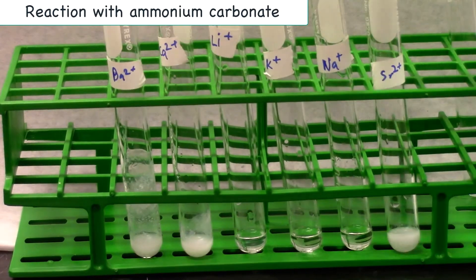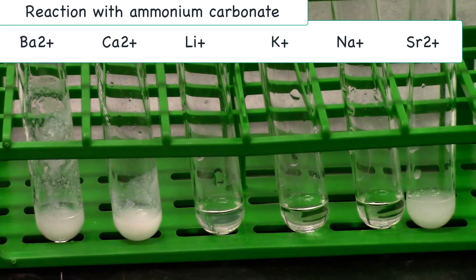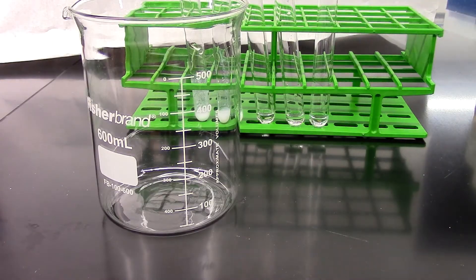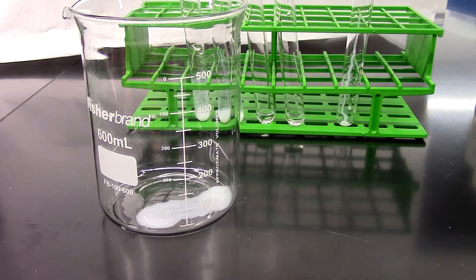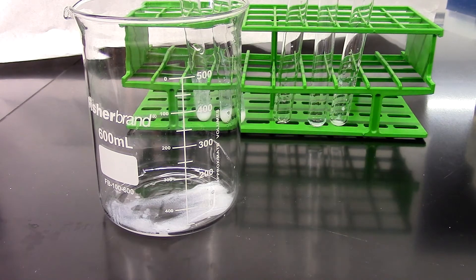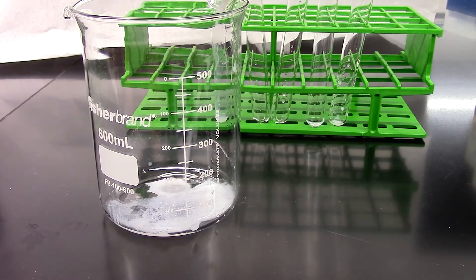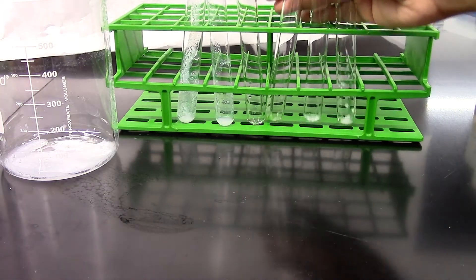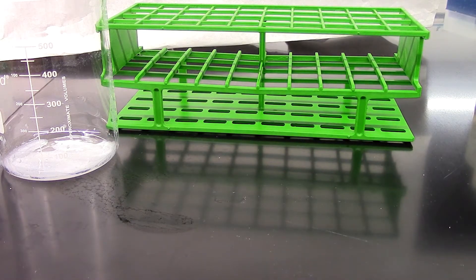I'll give it a mix. Record your observation as precipitate or no reaction. Now I'm going to transfer all my reaction solution into a beaker and then dispose of the solution in a labeled waste bottle. Now I'm going to rinse these test tubes out and have them ready for the next part.